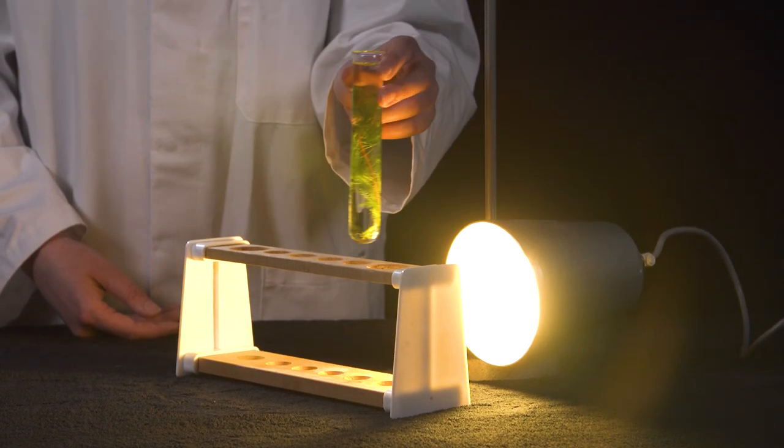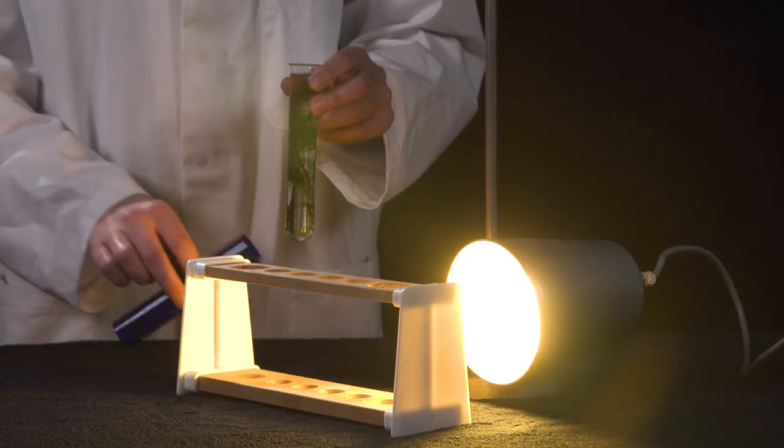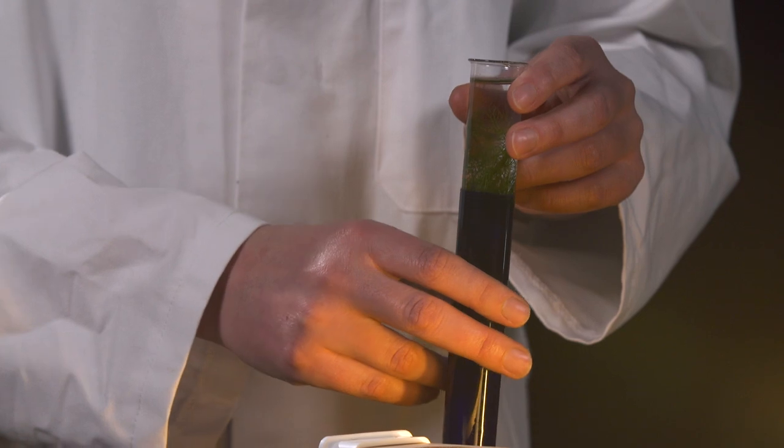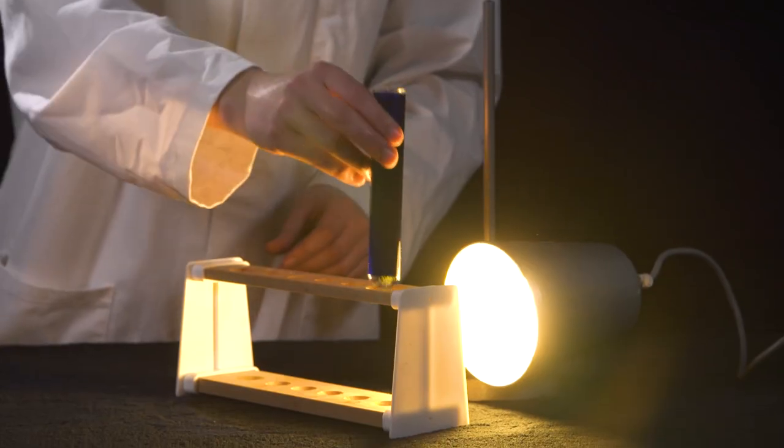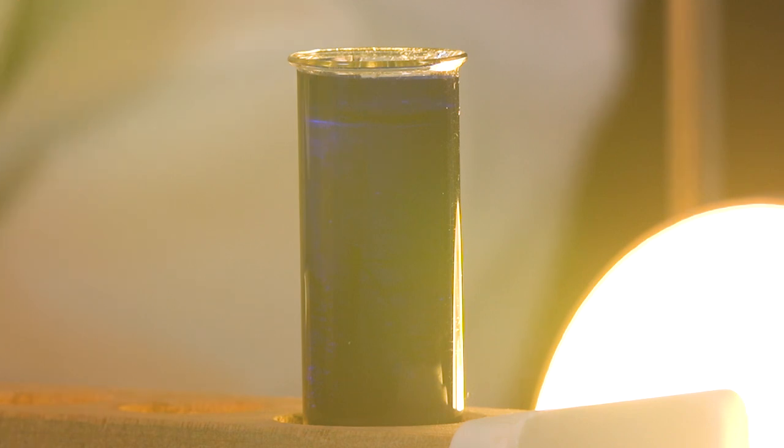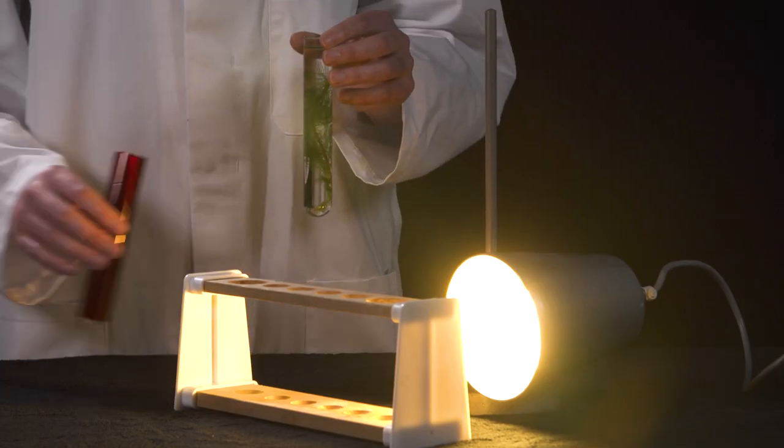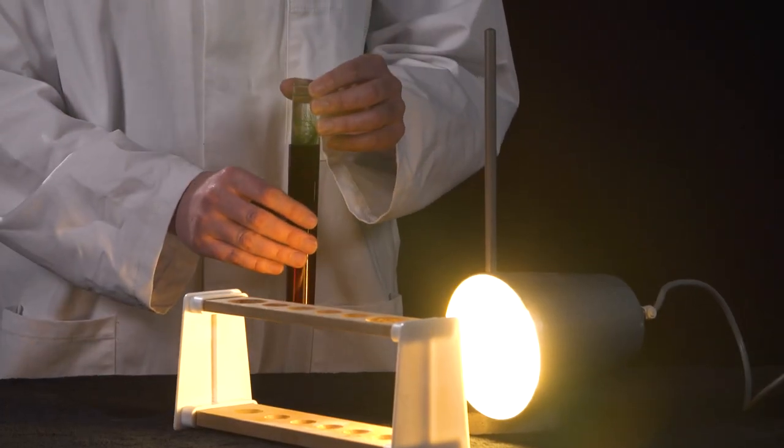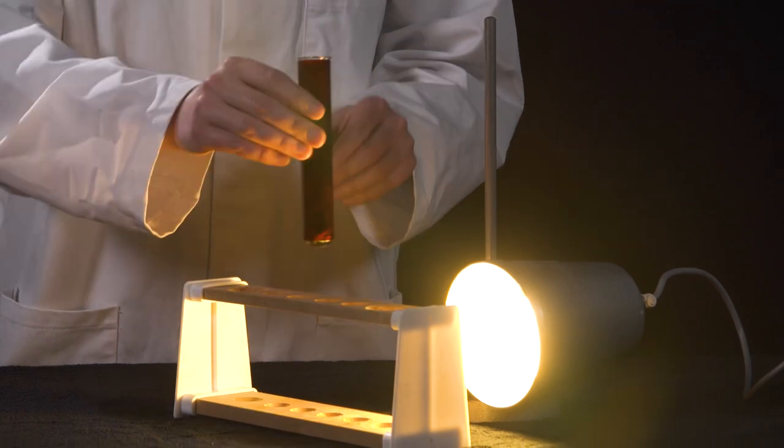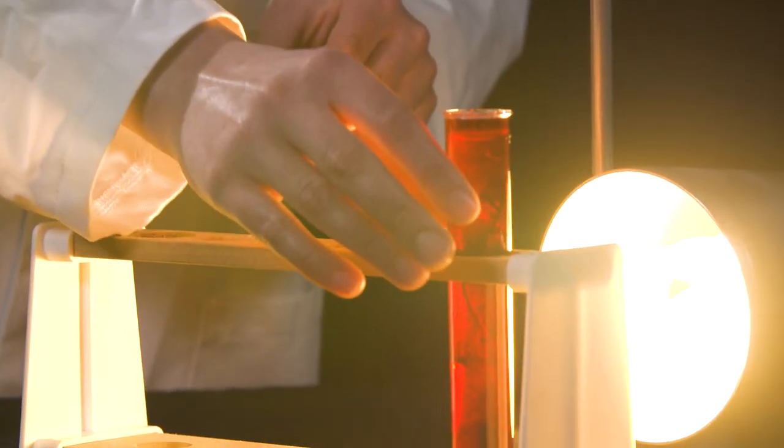Different coloured filter sleeves can be wrapped around the setup to allow students to investigate the effect of the wavelength of light on the rate of photosynthesis. From this they can develop their own absorption spectra and further their understanding of which wavelengths of light are used most efficiently by the plant.